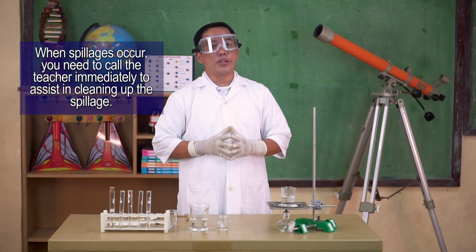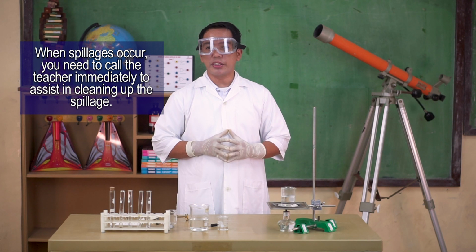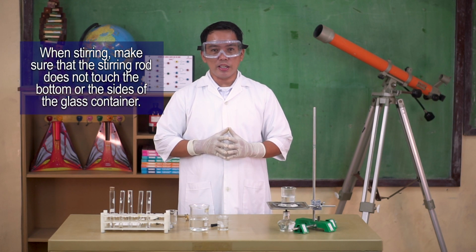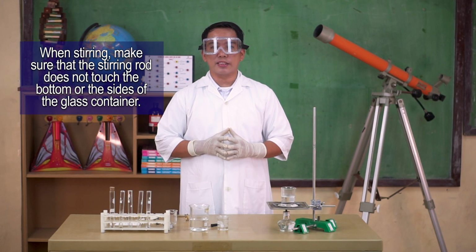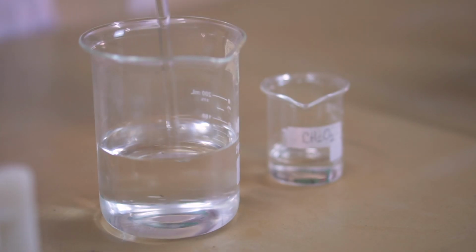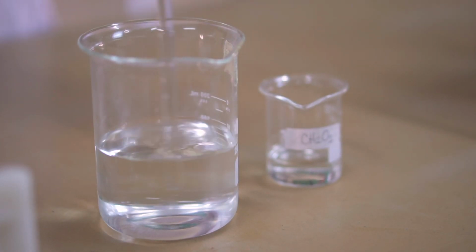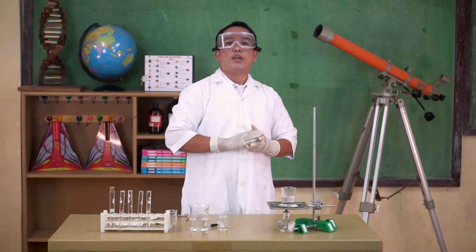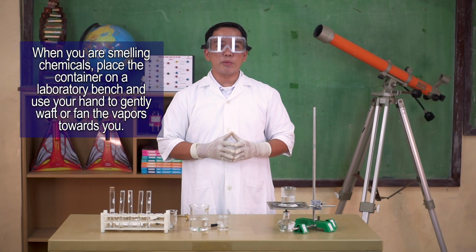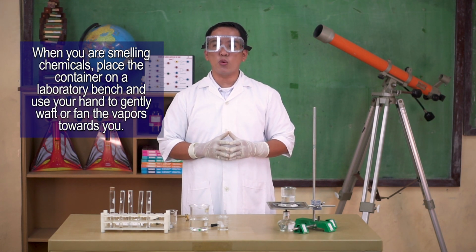When spillages occur, you need to call the teacher immediately to assist in cleaning up the spillage. When stirring, make sure that the stirring rod does not touch the bottom or the sides of the glass container. When you are smelling chemicals, place the container on a laboratory bench and use your hand to gently waft or fan the vapors towards you.